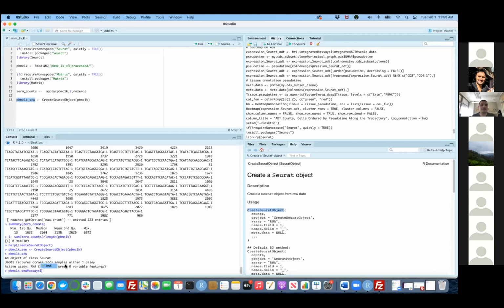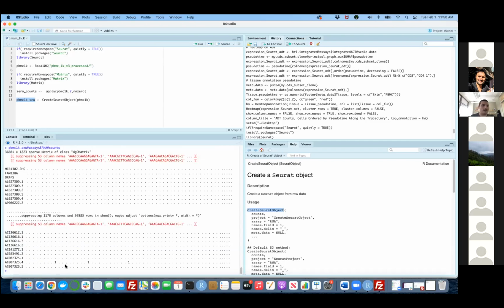This is basically the reason that we are using R objects. We are trying to simplify the process so that you don't have to have multiple objects to track your analysis. Seurat enables you to store each part of a project in the same object, accessible from the same object. You can click on it, then click on @ again, and you can see the count matrix over here.